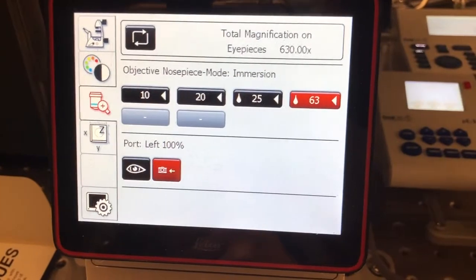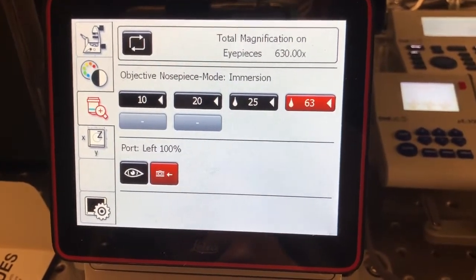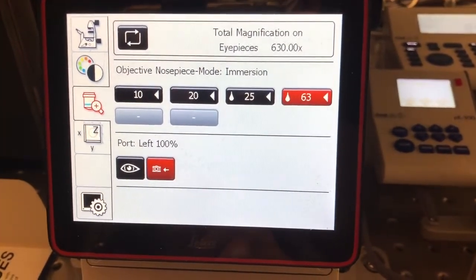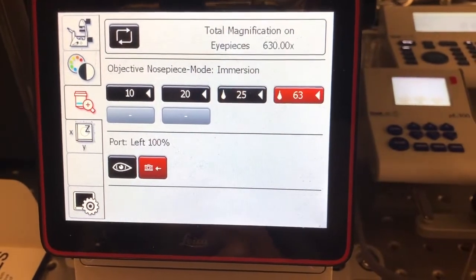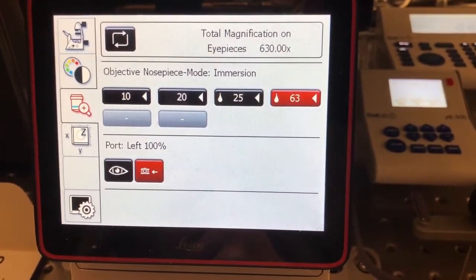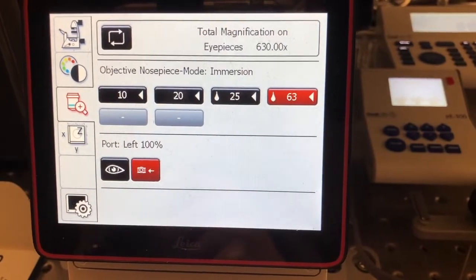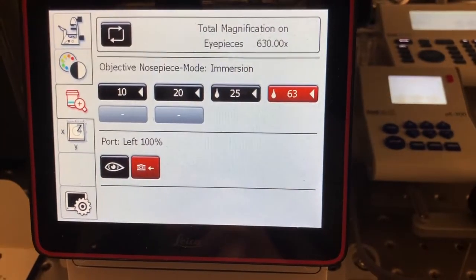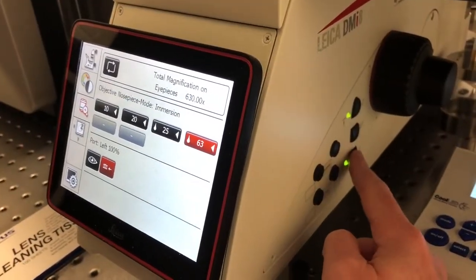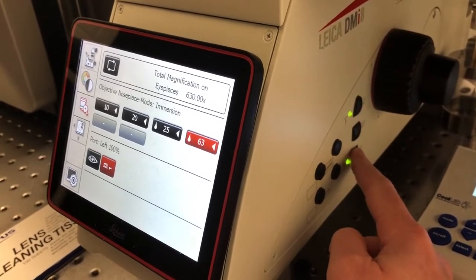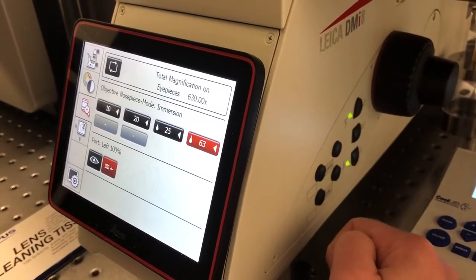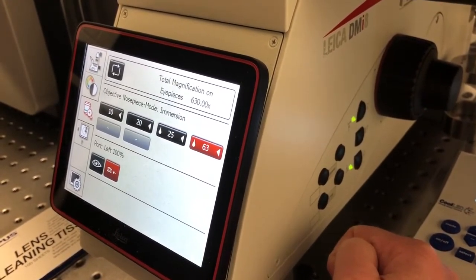It's important that before you change objectives to an oil objective, if you are going to need to add oil and the sample is there, you make sure that you lower the objective all the way to the bottom of its travel range. To accomplish that we can press the down Z button here, which will move the objective, if you press and hold it, all the way as far down as possible.